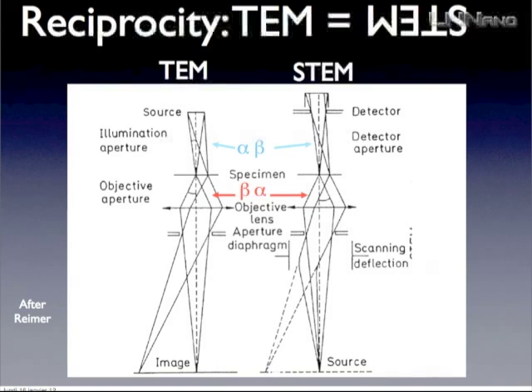And if you know a little bit of TEM, you know that, so having a detector off axis means that you will have an angle here, okay, between the detector and sample. And if we translate it with the reciprocity theorem, it means that you will have a source which will send a beam with an angle. And most probably, or maybe not, I don't know, but in a TEM, when you have an angle, it induced some kind of fake astigmatism.